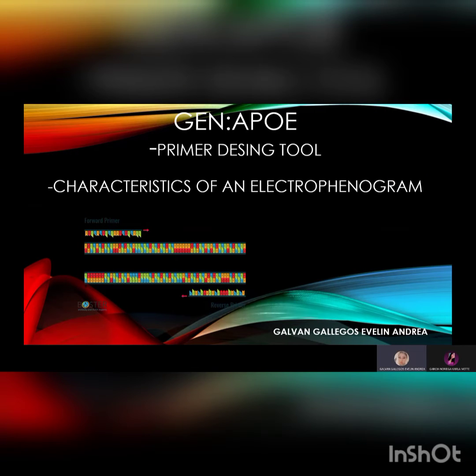Good morning, everybody. I'm going to present the primer design tools of the gene. Number 1. Open Google and look for online analysis tools. In DNA sequence analysis, select PCR primer design. You should select and look for Primer-BLAST.